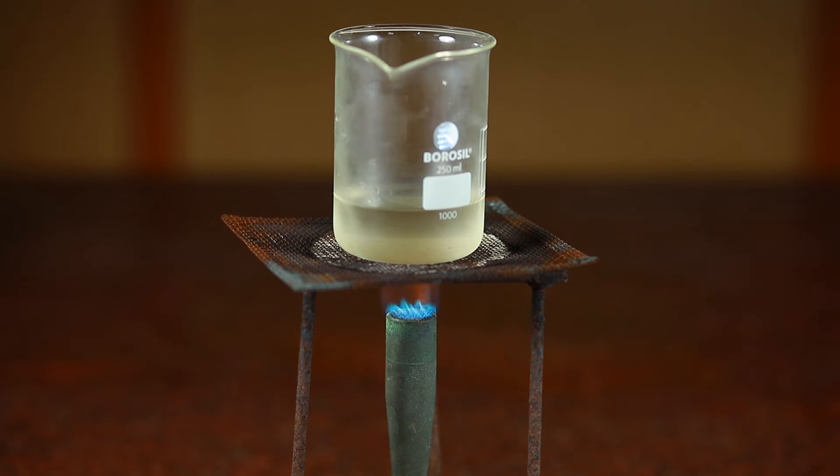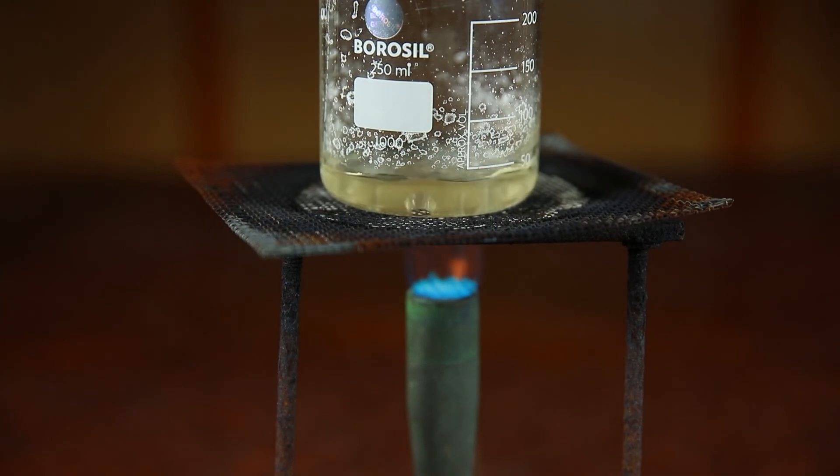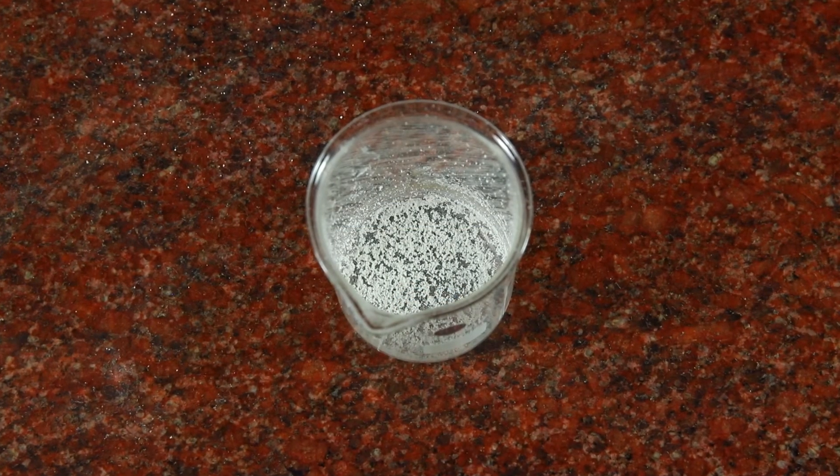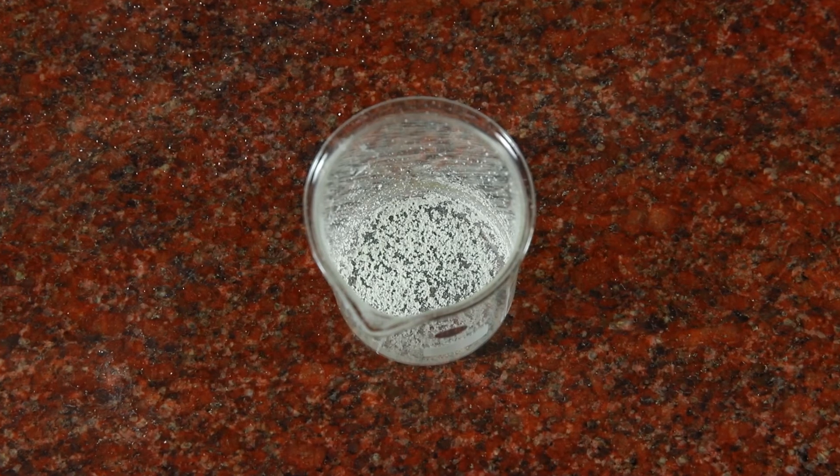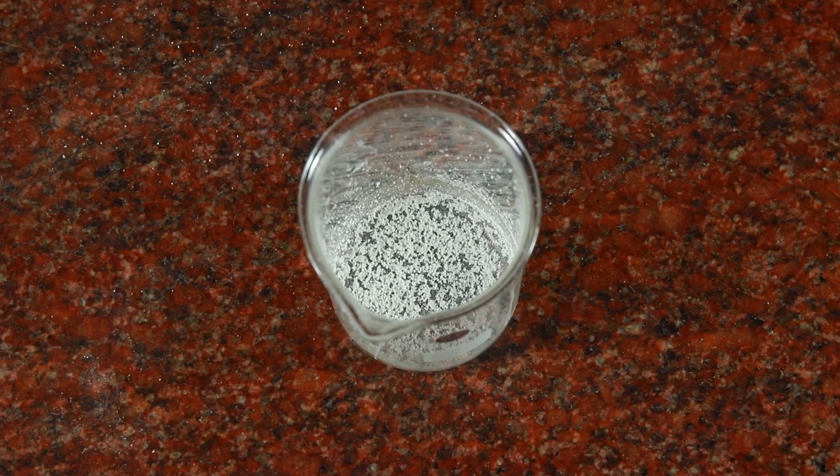Heat the filtrate obtained in the previous step using the burner. Heat the content until water evaporates. We observe that on heating the filtrate, water is evaporated and a white colored substance, common salt, is left at the bottom of the beaker.